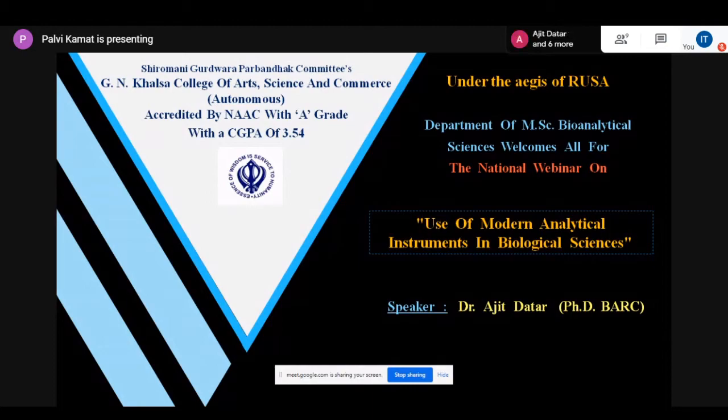From simple and compound microscopes to now revolutionary scanning and transmission electron microscopes, from demonstrating chromatography on chalk to sophisticated HPTLC, from a basic glass column to modern HPLC, and from the first spectrophotometer in the 1940s to the most advanced hyphenated LCMS, analytical instruments have taken a great leap.